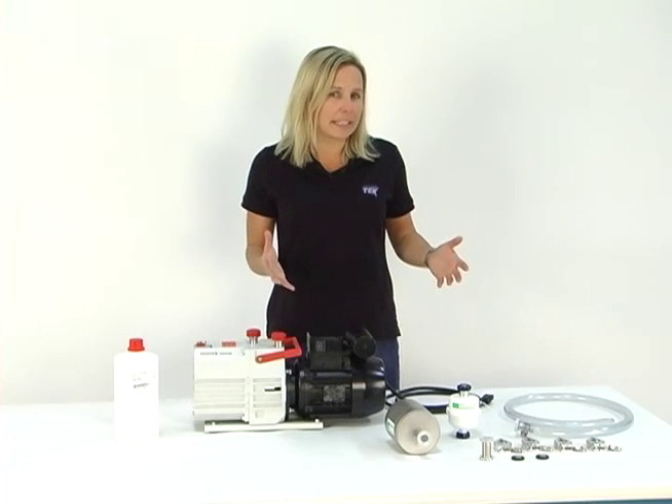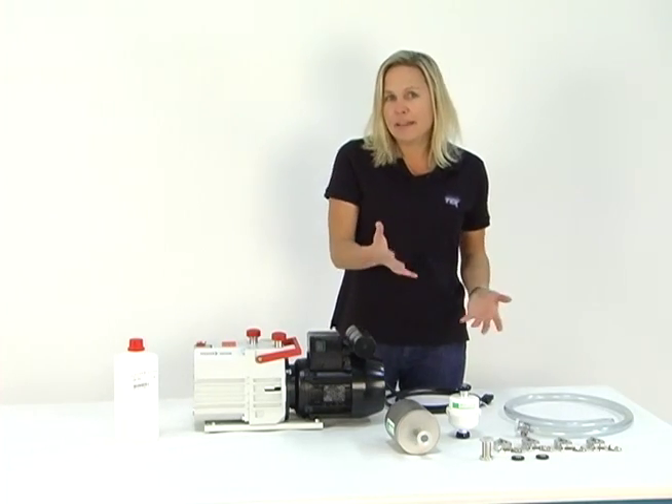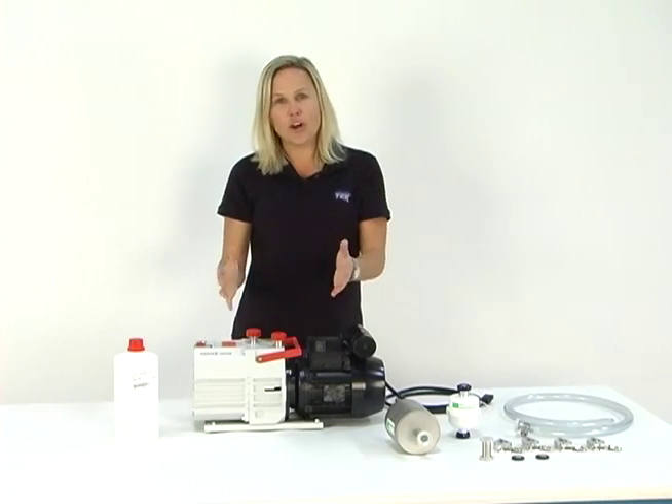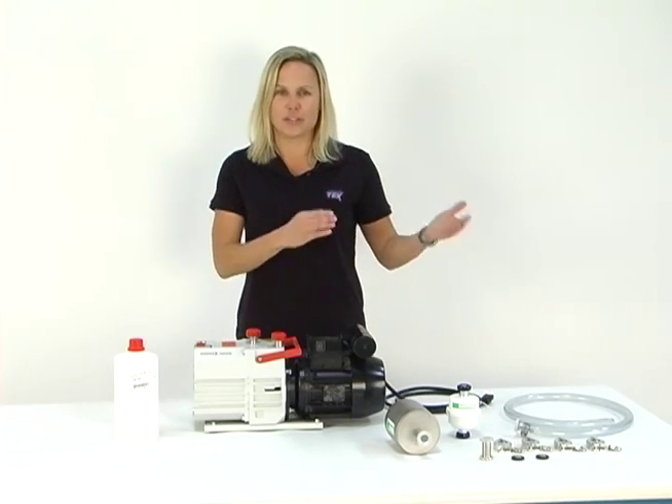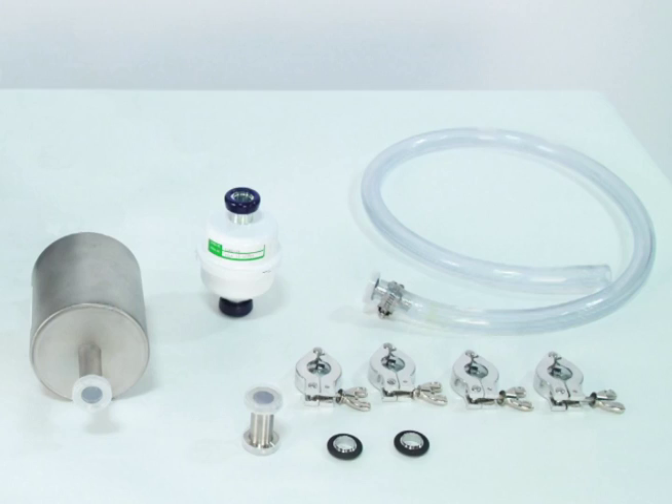So when you buy this connection kit, I'm going to explain to you a little bit about what you get, and then I will go ahead and actually install the connection kit — vacuum pump to oven. This is your connection kit. These are all the pieces and parts that you need to connect your pump to your oven.